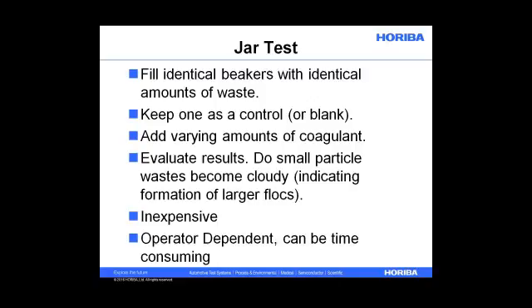Do you see your very fine particles start to clump up into visible flocks? That's a good idea. If you're patient enough, you can even wait and see how long it takes for the particles to settle. It's inexpensive, so that's always a great feature. You basically need a bunch of beakers, a bunch of stirrers, and a light box. And then it's operator dependent. You're really counting on your operator having the time to sit and look at these suspensions and evaluate each one.